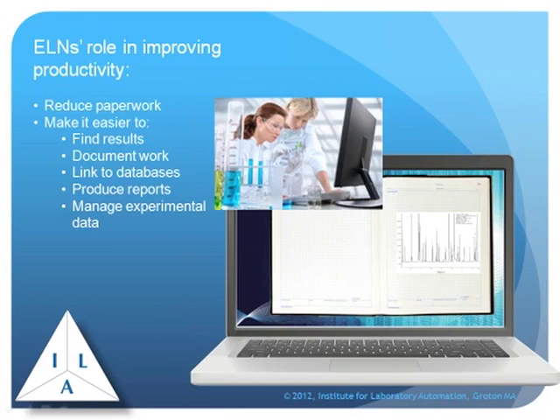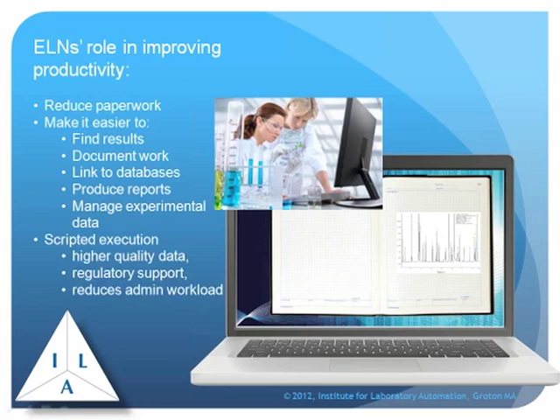So an ELN's role in productivity is much the same as it is in the LIMS system. They're just dealing with different applications. It reduces paperwork. It makes it easier to find results, which is very important if you're dealing with intellectual property concerns. It documents the work, provides links to databases, produces reports, and manages experimental data, but it really does it in a different way, in a completely different environment. One is a human-centered environment, the other is a process environment.